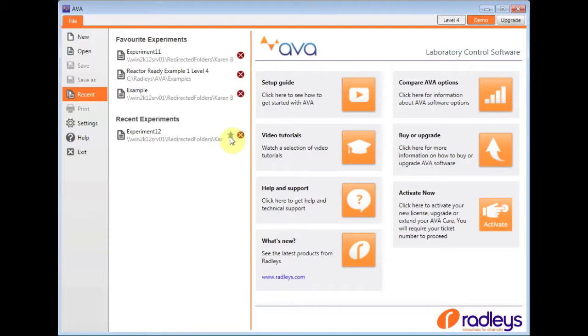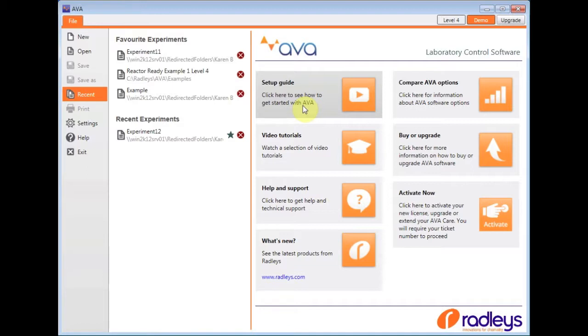As you can see on the right-hand side, there's also links here to setup guides and video tutorials which go through in detail how to set up experiments for your reaction.